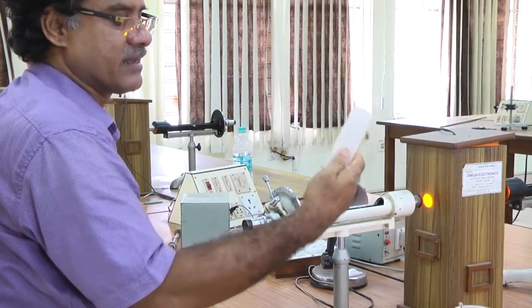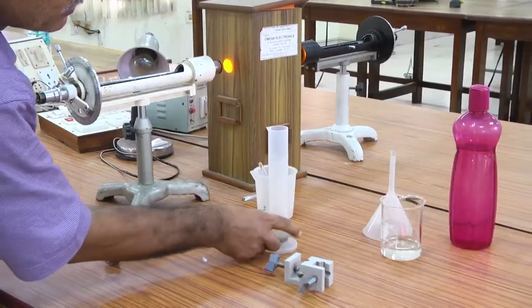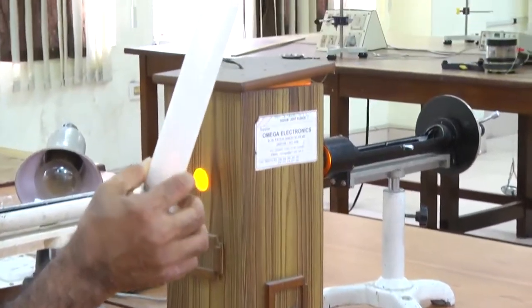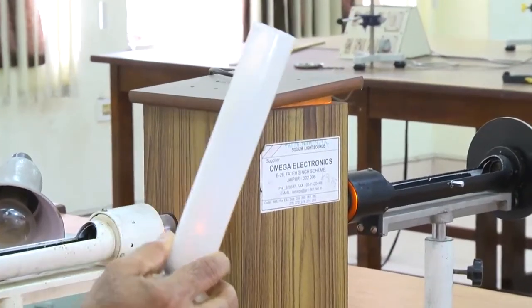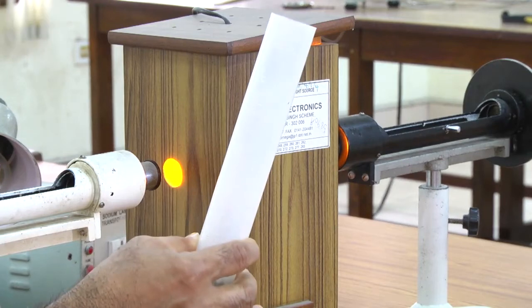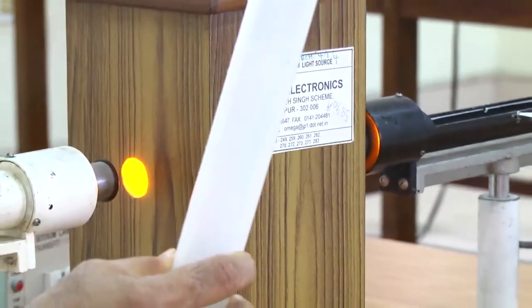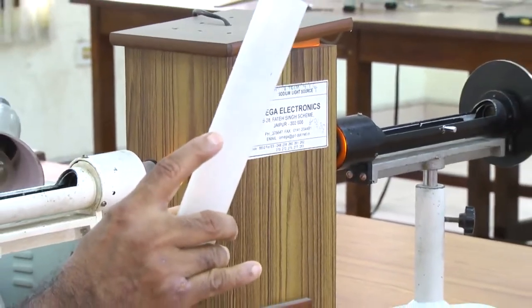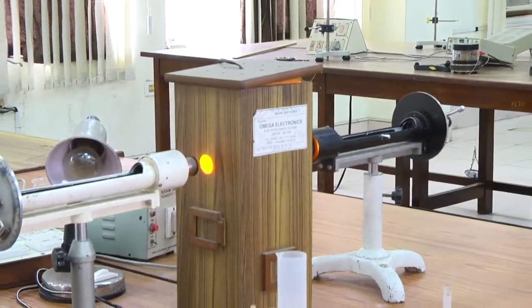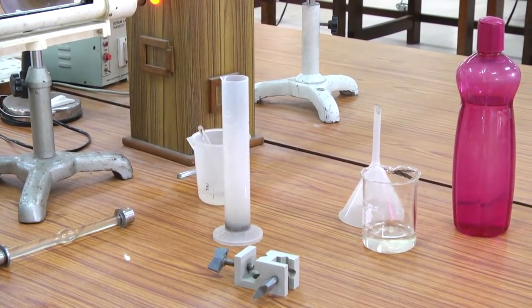Generally we take this, you see, there is a scale here of cm cube, cc. So, it is 100 cc, okay, and now 20 gram sugar you can put in 100 cc, or 10 gram sugar you can put in 50 cc, okay. So, make a 20% solution, okay.